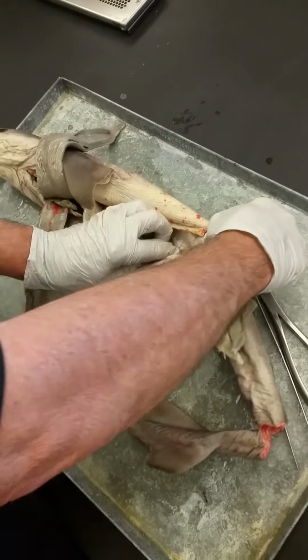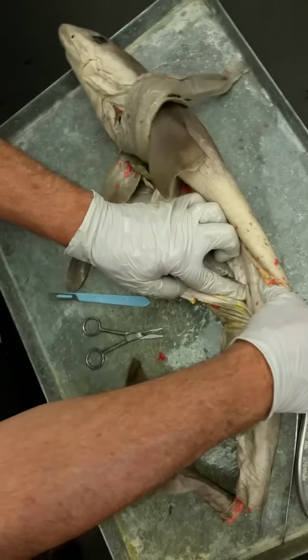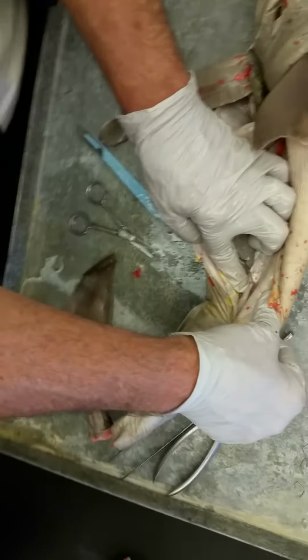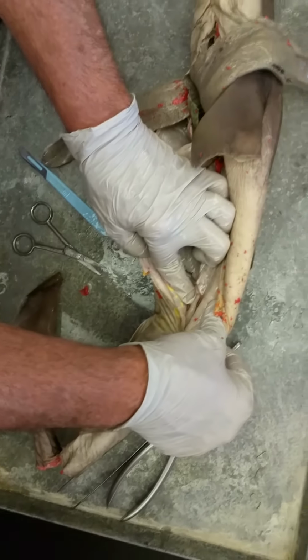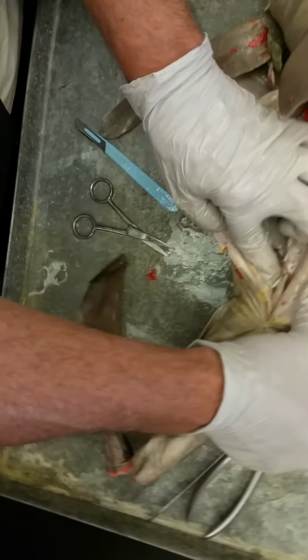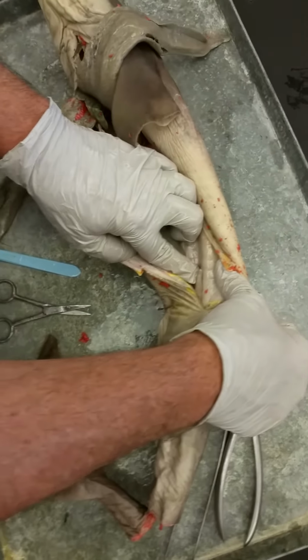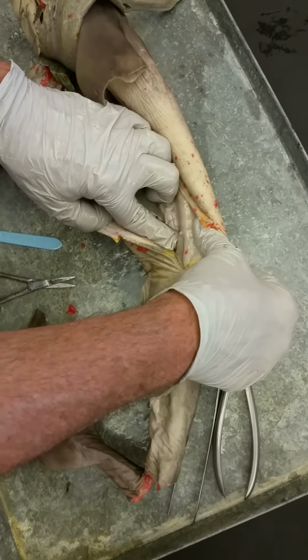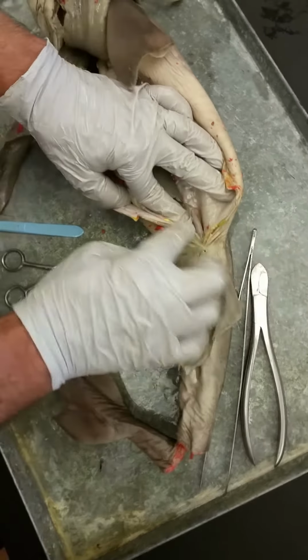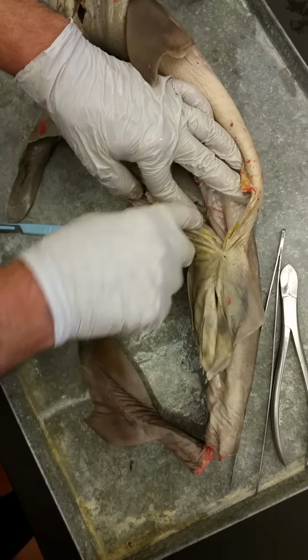This little sausage-like structure here, that's the rectal gland. Remember we talked about the rectal gland and osmoregulation? So that's used for salt balance. Remember that even though they're hypertonic to seawater, they're low in salt, so they need to constantly be pumping out salt. Besides their gills, it's one of the tissues that they have that's constantly dumping salt out of their body. That's what I was harvesting for people who are studying chloride channels, little rectal glands.